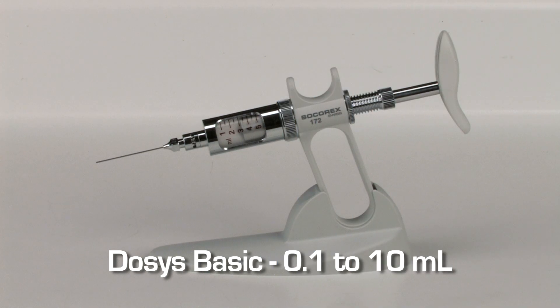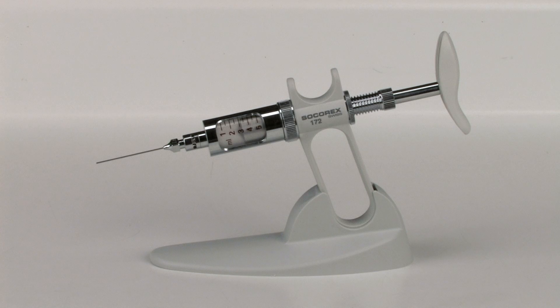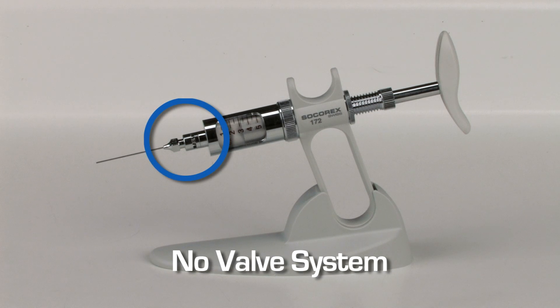The Dosus Basic model allows automatic liquid aspiration and distribution through the same opening. It does not include a valve system.